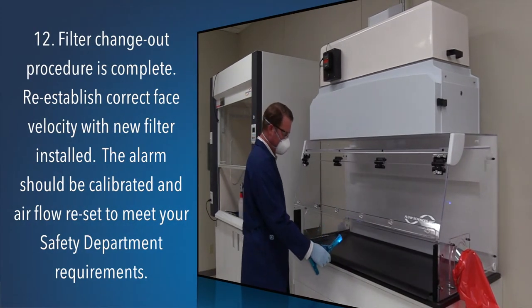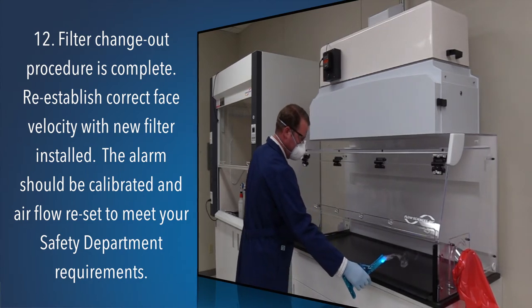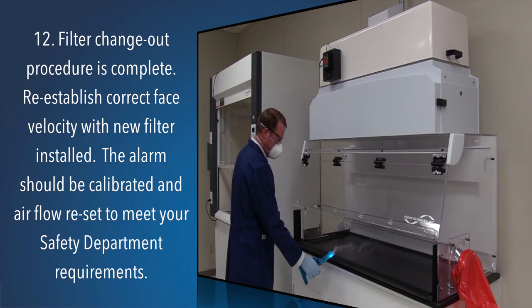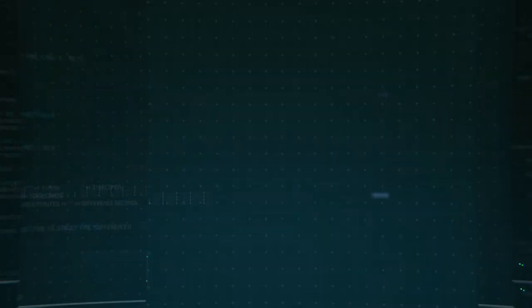Step 12: Filter changeout procedure is complete. Re-establish correct face velocity with the new filter installed. The alarm should be calibrated and airflow reset to meet your safety department requirements.